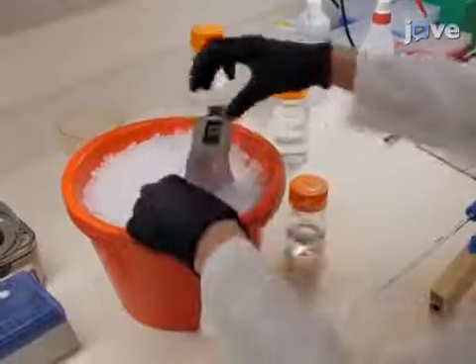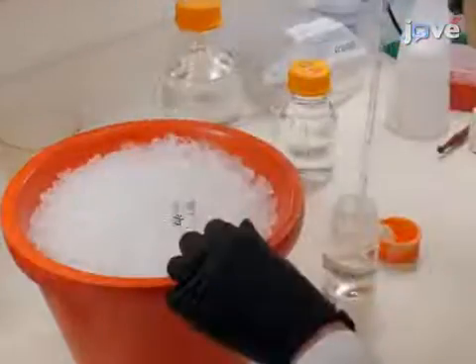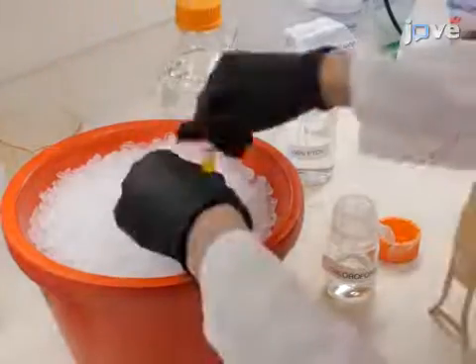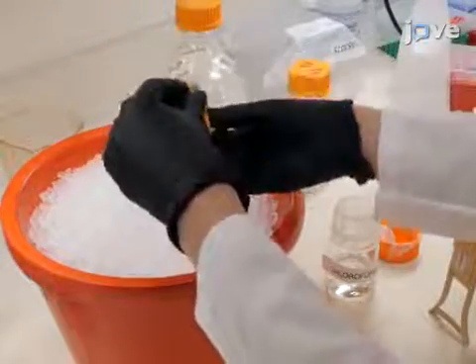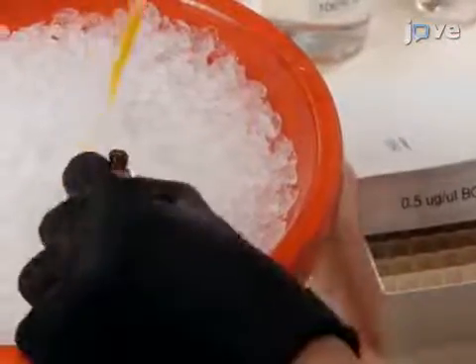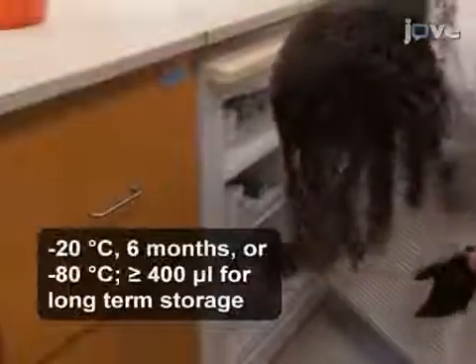To begin, suspend one milligram of powdered fluorescent lipid analog in two milliliters of 100% chloroform for a final concentration of 0.5 micrograms per microliter. Aliquot the analog into amber glass tubes with screw caps compatible with the solvent that contain a Teflon gasket. Store these stocks in the freezer.